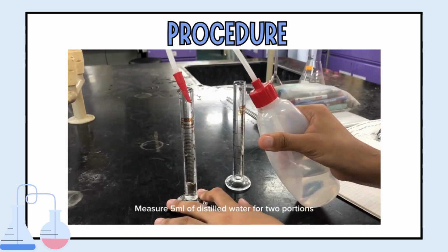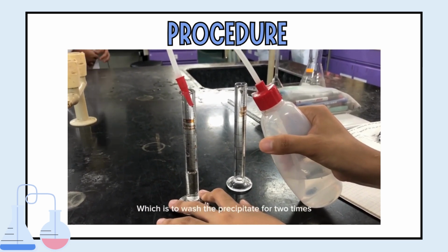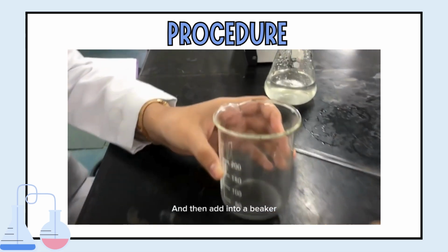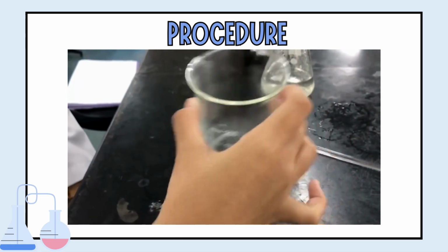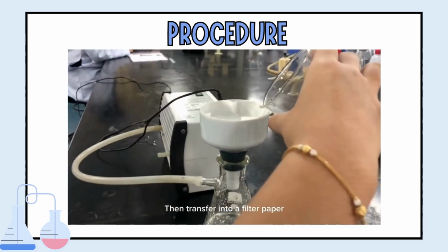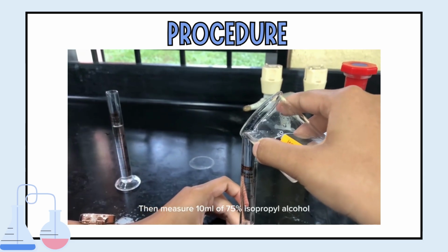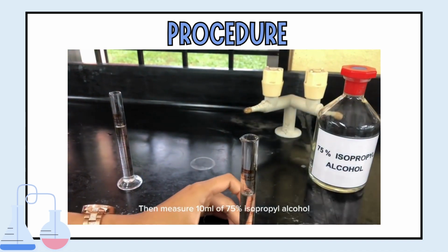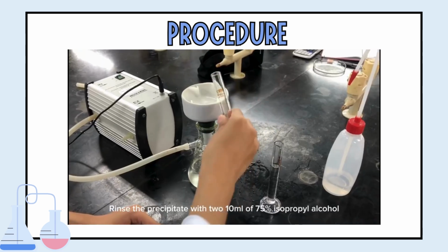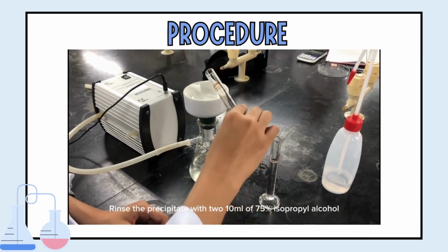Measure 5 ml of distilled water for 2 portions, to wash the precipitate 2 times, and then add it into the beaker. Then transfer it into the filter paper. Then measure 10 ml of 75% isopropyl alcohol. Rinse the precipitate with 2 portions of 10 ml of 75% isopropyl alcohol.